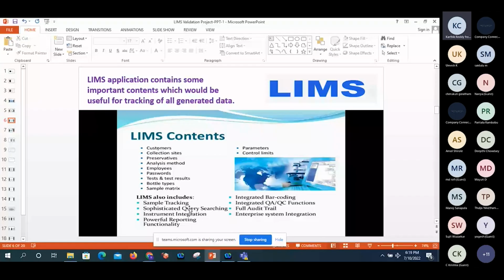Why? Because there are subroutines, some SQL writing, global context, global text, all these things that need to be written. After that, there are so many balances in a quality control laboratory, and each balance needs a separate parsing script. Coming to powerful reporting, COA generation will happen once a lot is generated. There is environment monitoring, and an environment monitoring trend report will be generated. All these things will happen.